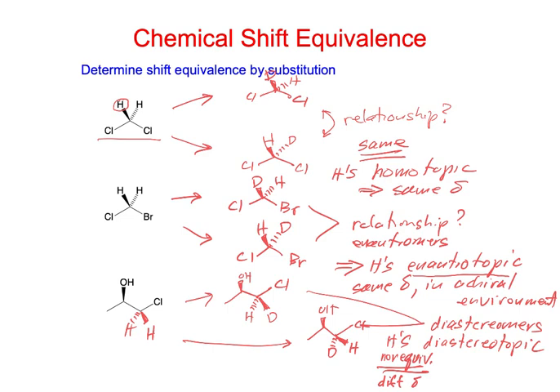They could be coincidentally very close in chemical shift. Certainly, the higher the magnetic field, the better chance you have to resolve them, but they could still overlap, right? Just because they're diastereotopic and they have different chemical shifts does not mean they're always going to be resolved from one another, from a practical point of view. But as you go to infinity. Right, yeah.